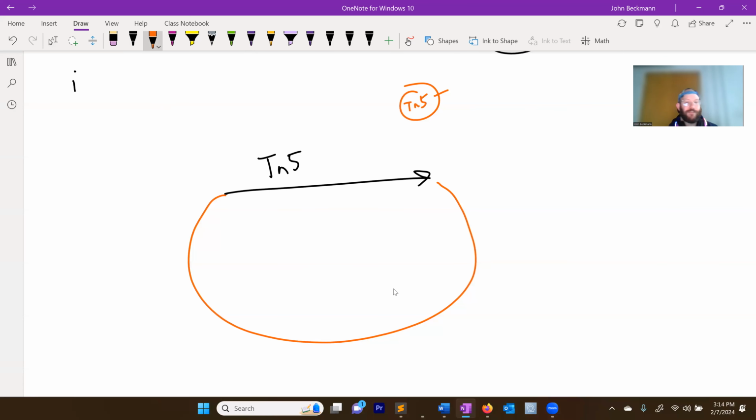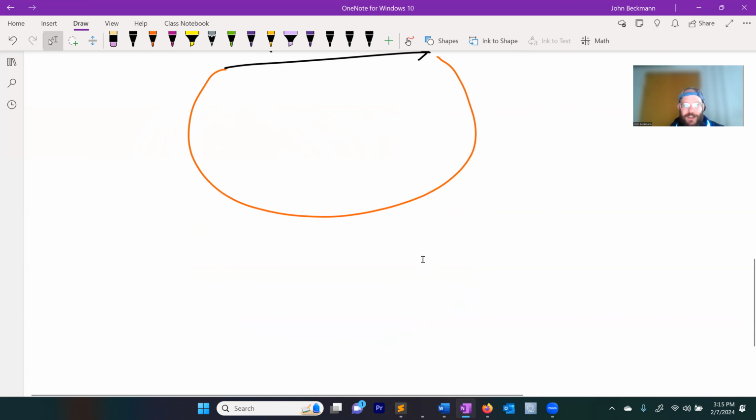Okay, so in Tn5, people who use Tn5 are not using a wild type version, they're using a version that's been mutated to have enhanced jumping activity. So when you ask what it is about the mutation that makes the protein have enhanced functionality, that depends on the very specific protein and the very specific mutation. Somebody perhaps studied that and found that if you change this little position to this, it makes it a better jumper, right? That's very specific. My point is that it's very common that you want to change a base for whatever reason, and one example is making a protein more functional if you know how to do it.